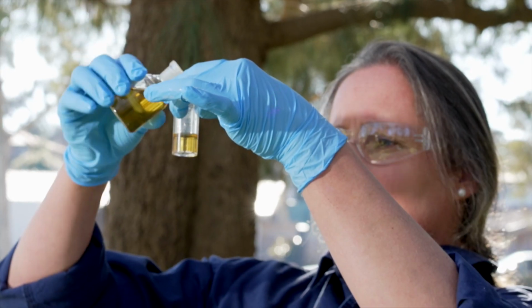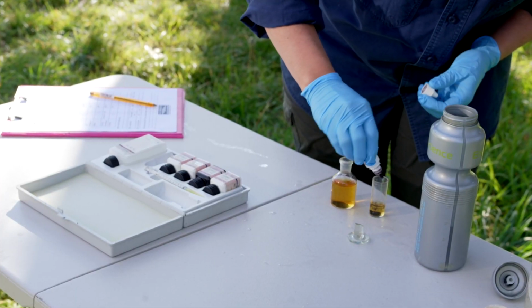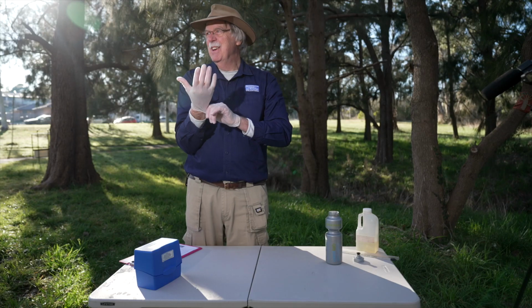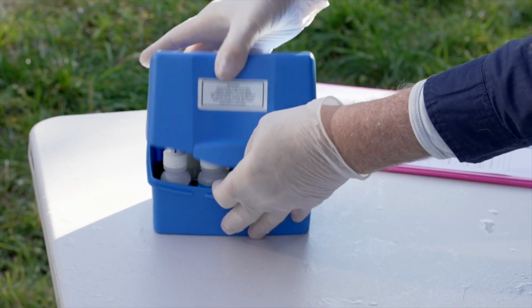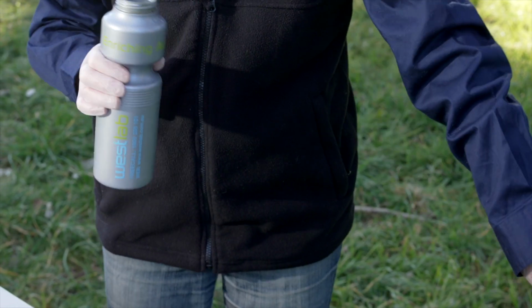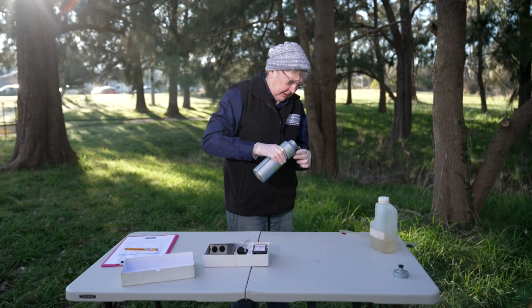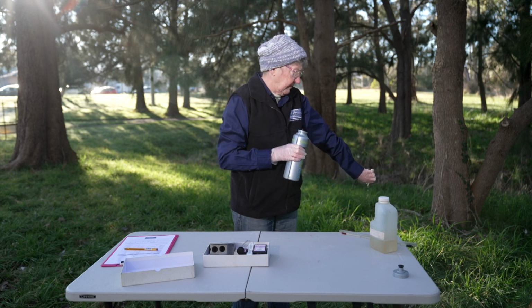You may now continue with all the tests at home, starting with dissolved oxygen and then the rest of the tests. Before conducting each test, remember to wear the appropriate personal protective equipment, such as gloves and safety glasses, as some of the tests involve the use of chemicals. Using your sample water, clean out every glass vial and tube before use. Rinse them 3 times to ensure that any water and chemicals from previous sampling has been removed.